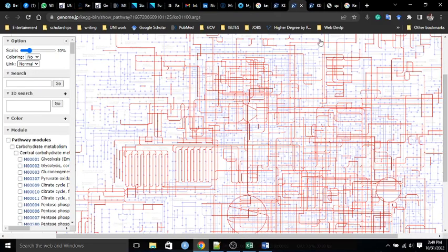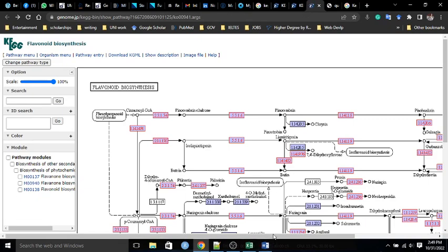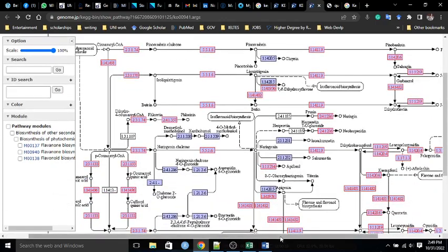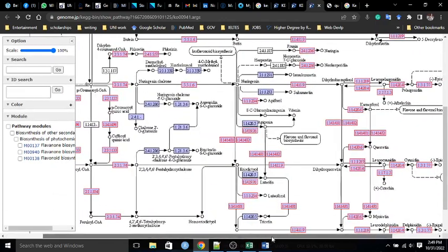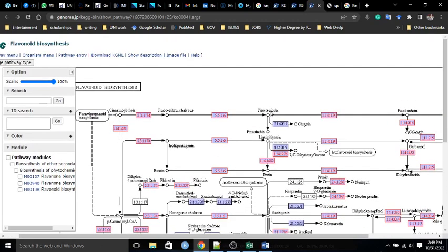Hello everybody. Today we are going to discuss the KEGG database. This is a Japanese database which will give us results about primary and secondary metabolites, amino acids, and many more things like disease and much more. So we will proceed to the data.